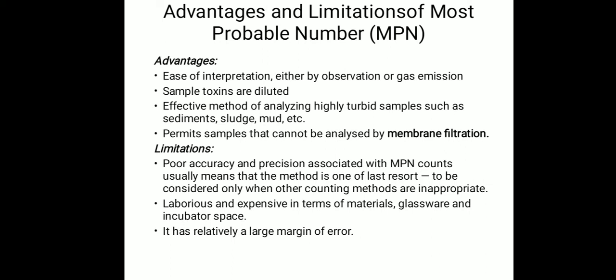Then the advantages of most probable number. So what are the advantages we have? The advantage is that MPN is easy to interpret, either by observation or gas emission.